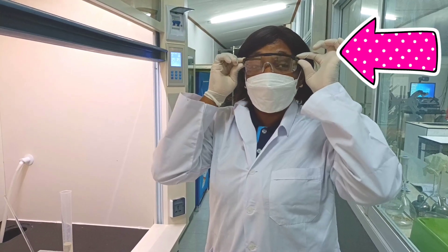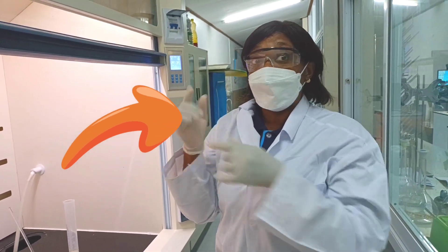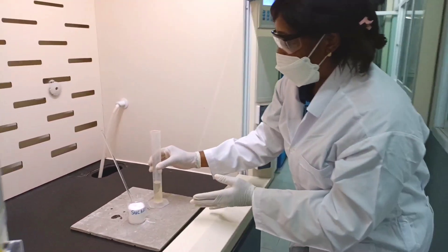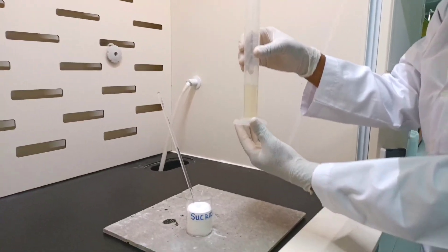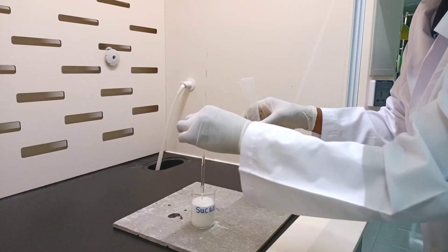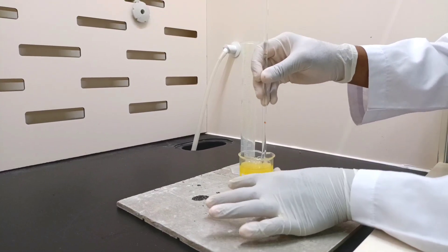I have my safety goggles in case of any acid spill, I am wearing my gloves so as not to touch any acid, and I am also wearing a mask. Now let's start — I'll take my 30 milliliters of concentrated sulfuric acid and pour it into my sucrose.